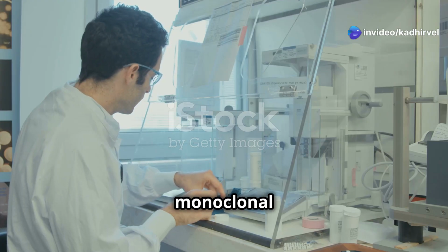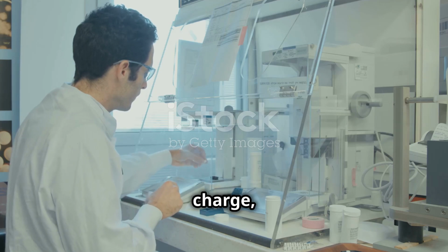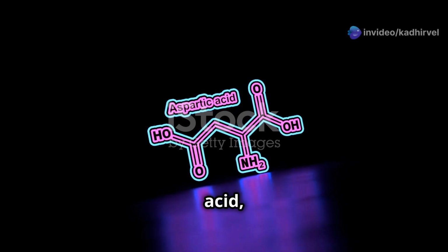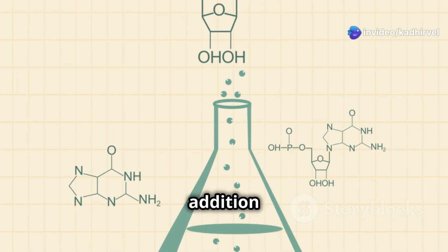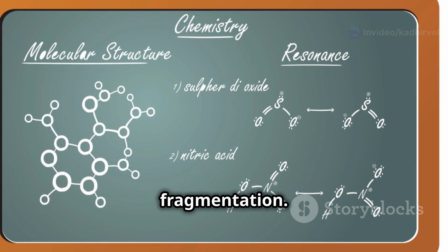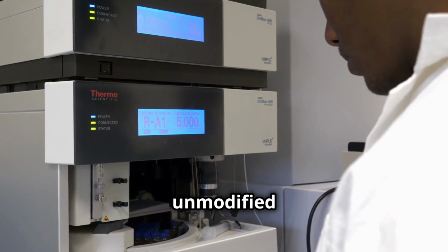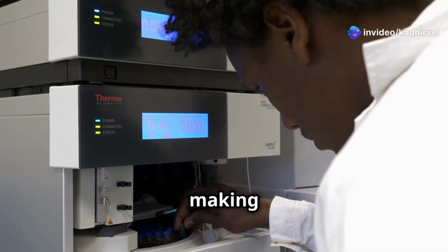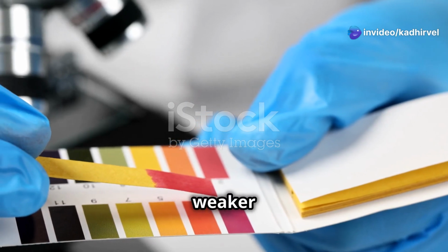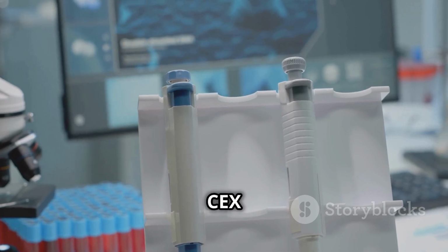Acidic variants in monoclonal antibodies are typically forms with modifications that introduce more negative charge, such as deamidation, which is the conversion of asparagine to aspartic acid, sialylation, which involves the addition of negatively charged sialic acid residues, or fragmentation. These modifications reduce the overall positive charge of the variant compared to the unmodified monoclonal antibody, making it more acidic. At a given pH, the acidic variants will therefore have a weaker positive charge than the main monoclonal antibody, which affects their interaction with the CEX resin.